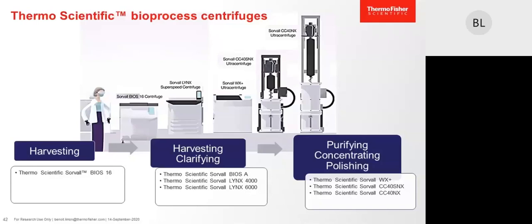Then the centrifuge to isolate the full capsid from the empty capsid in the density gradient, and then the IEX, the ion exchange, to remove the density gradient from the full capsid. So different techniques and different strategies based on the product.